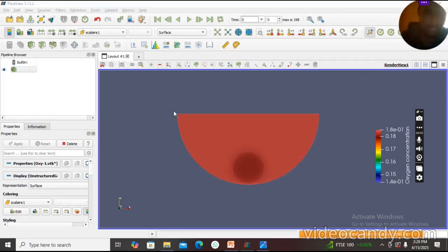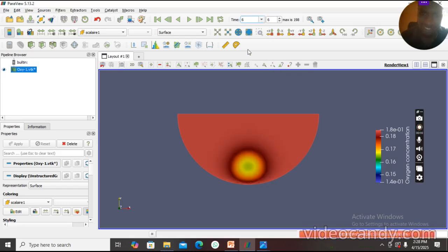I was still saying that the difference between the first one, where we're analyzing a single point, is that this one has given us the time scale. And if you want, maybe let us try to choose up to 6 seconds. You can see how it is. And so well, I'm going to try to bring out the animation.